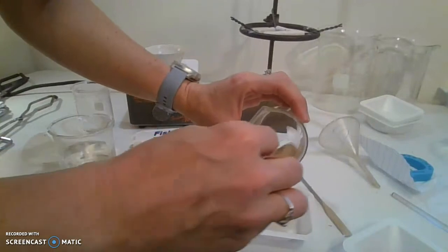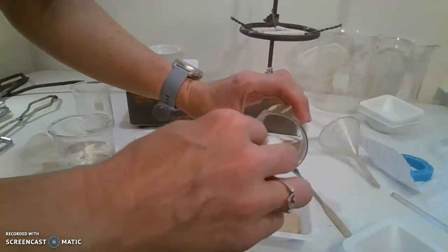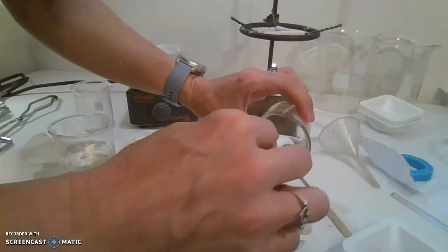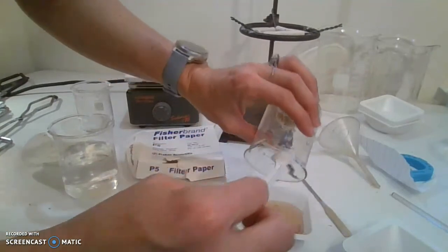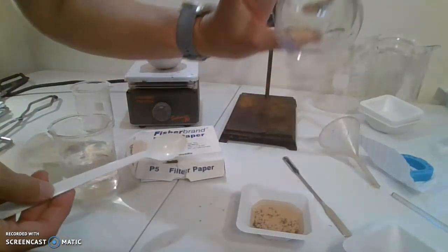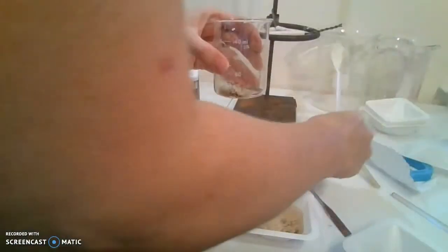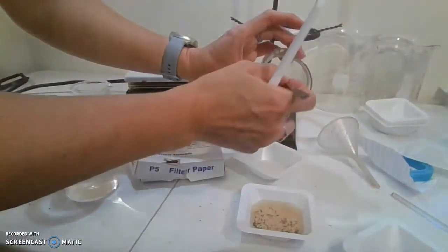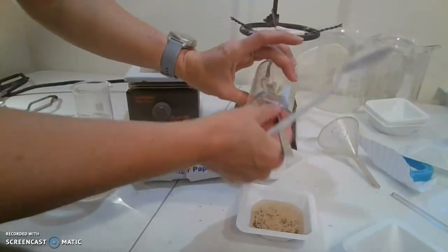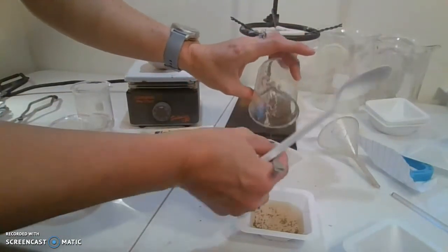They are less dense, so if you're really careful with the water, you can usually pour the poppy seeds off, leaving the sand behind. You can empty your sand into another one of these weigh boats.